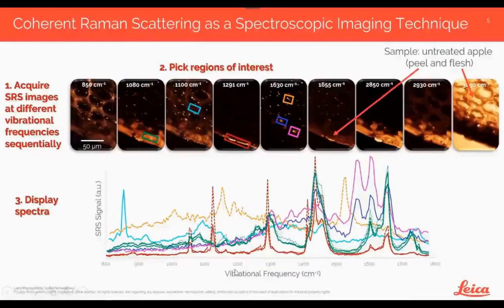And once more, the coherent Raman spectra are limited down to a lower limit of 1200 wave numbers, whereas the stimulated Raman scattering spectra, they are recorded in the transmitted light direction, so there's no such spectral hindrance. And in this case, I'm showing data that go down to a vibrational frequency of 800 inverse centimeters, but we can go down to 500 wave numbers with stimulated Raman scattering.